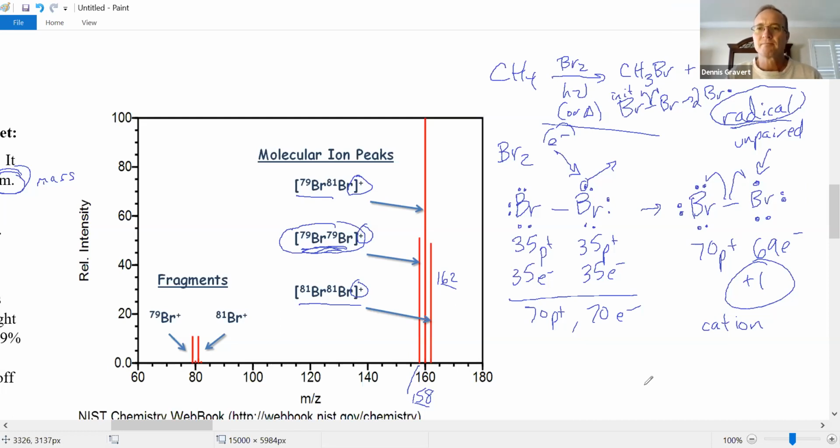And if I split this correctly, then this bromine on the left becomes Br. It still has its 3 lone pairs, becomes a radical. And the other one, well, it has 2 lone pairs, had the radical up on top, and then when the covalent bond split, you gain another radical.